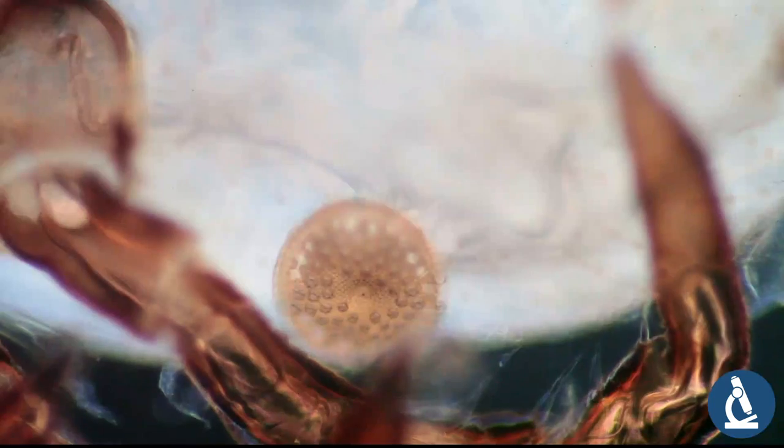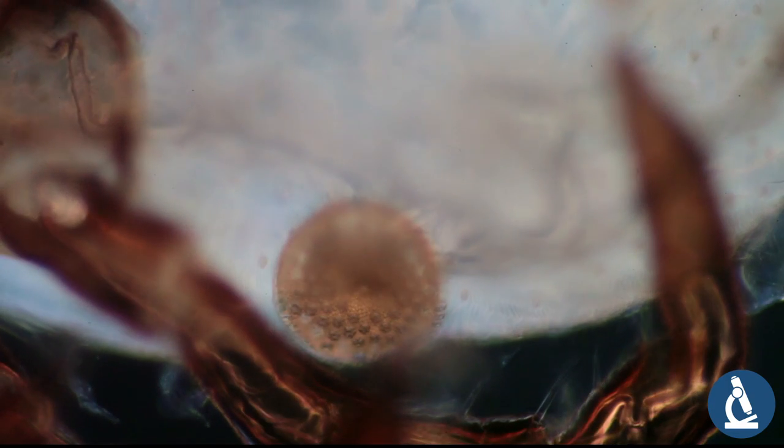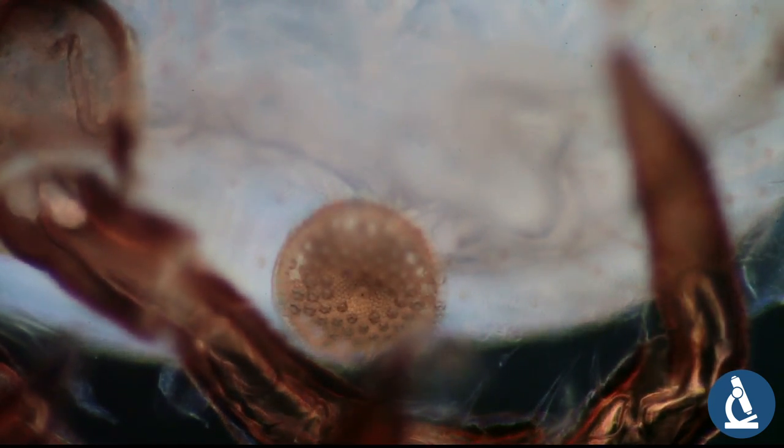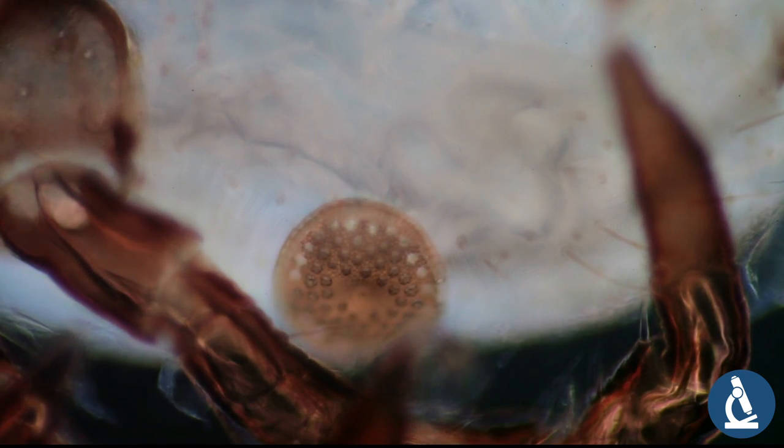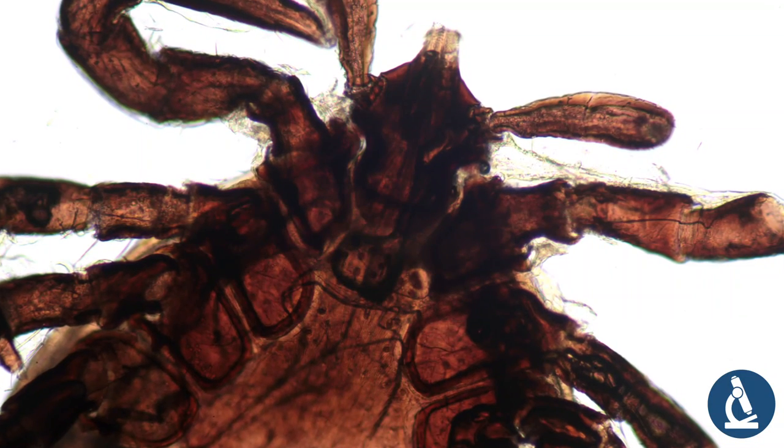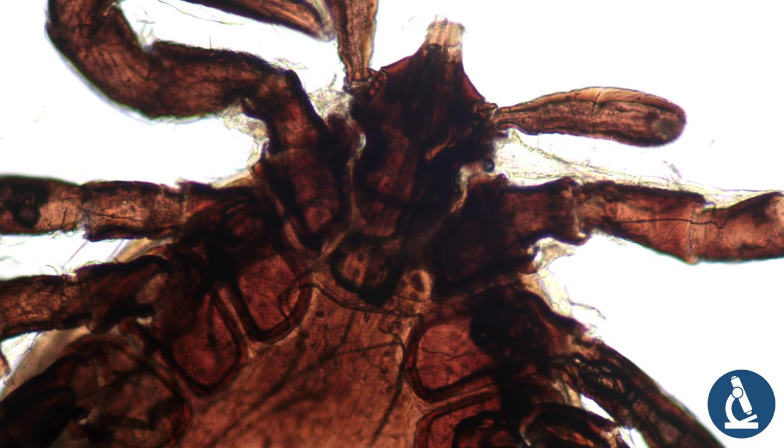But I think we still can see quite nice. This round structure here might be actually the so-called stigma. This is an opening in the exoskeleton of the tick, and this is how the tick actually gets air because there is a system of so-called trachea connected to it which supply the tick with oxygen.